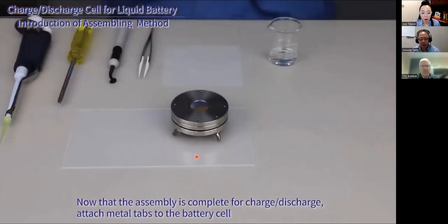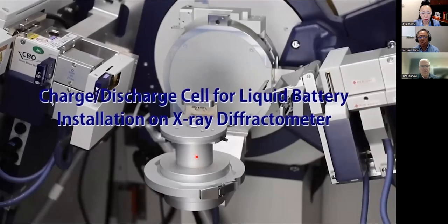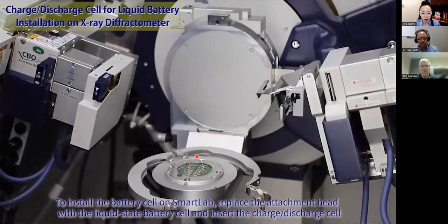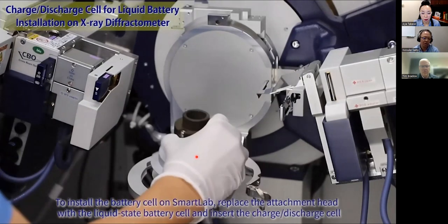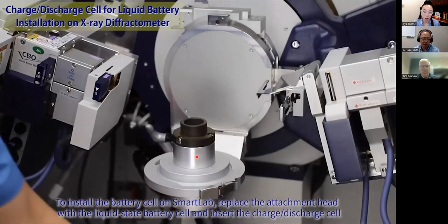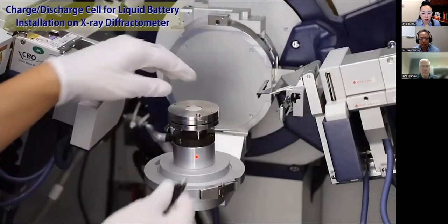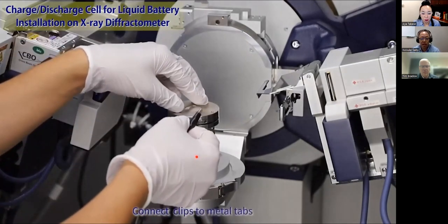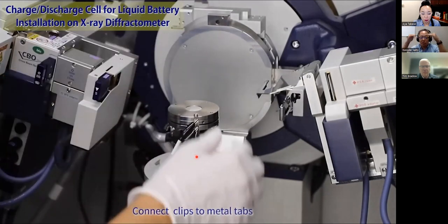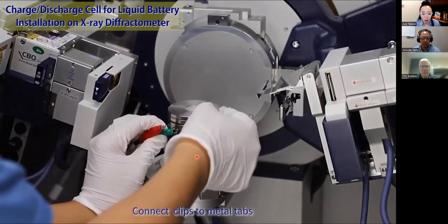The sample is ready. Next is the diffractometer. This is just our diffractometer as an example. On our diffractometer, you can exchange the sample stage easily like this. I just removed the conventional sample stage and put the base for the battery cell. Then you put the battery cell on top of it, and then you connect the potentiostat. Basically, that's it. The sample height is automatically adjusted and aligned by the instrument control software on the XRD instrument.